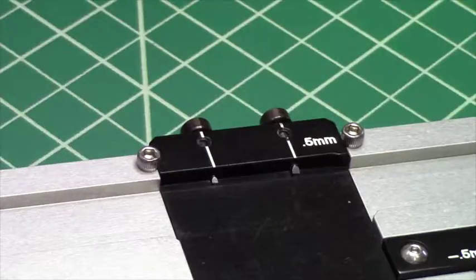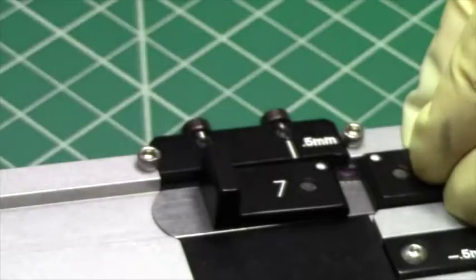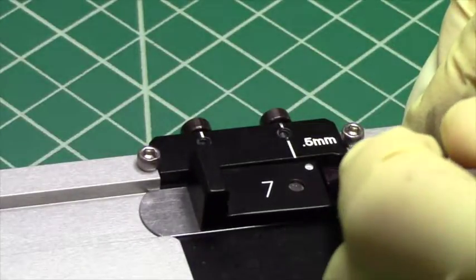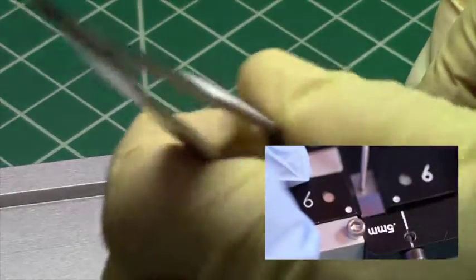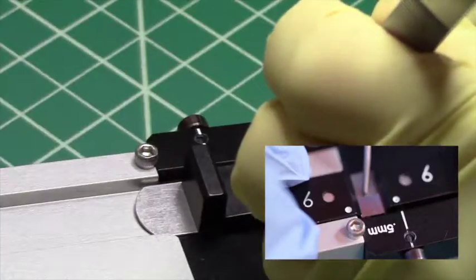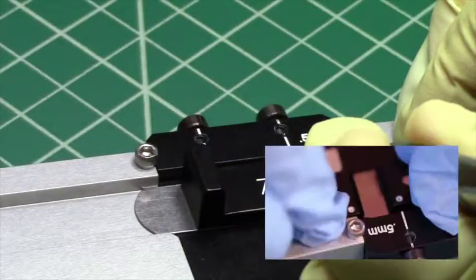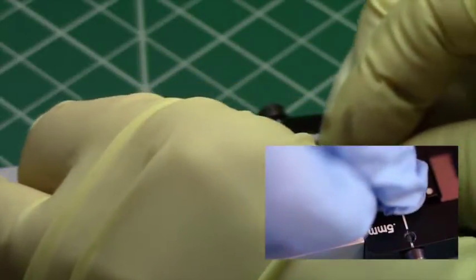I can also maintain the same setback for the cleaving by pushing the sample up against the half millimeter setback on the small sample cleaver, and then moving the sample over to the cleaving position and cleaving as normal.